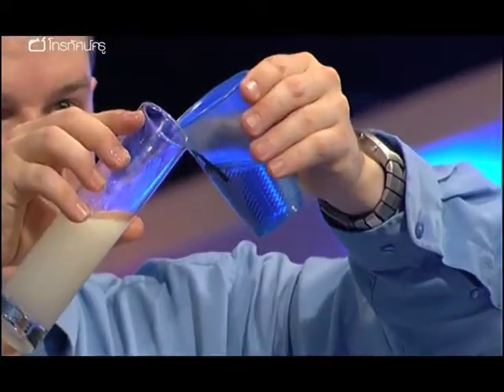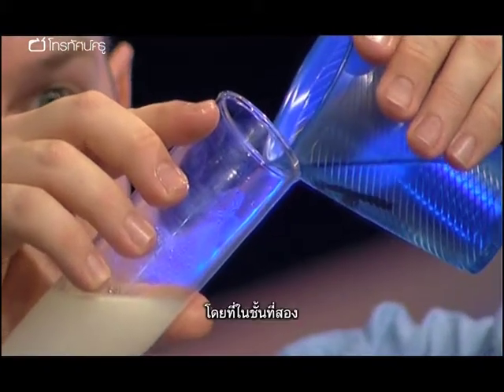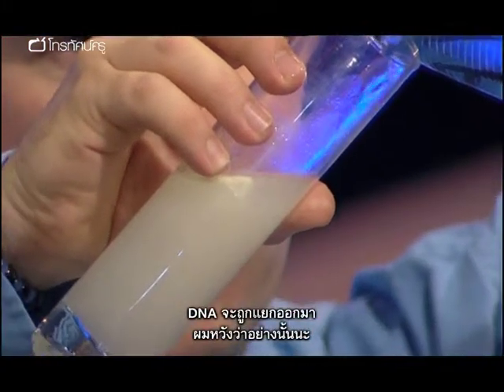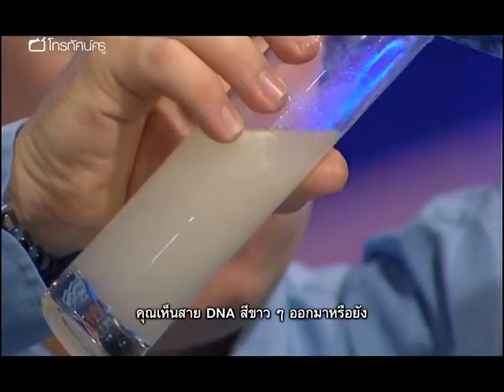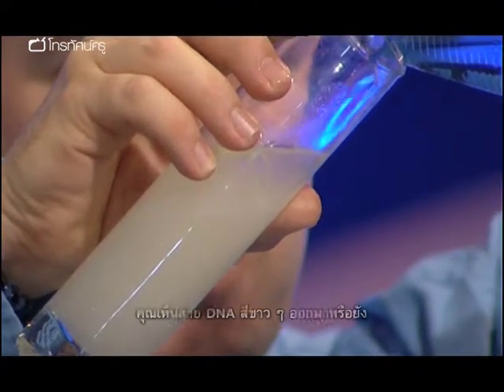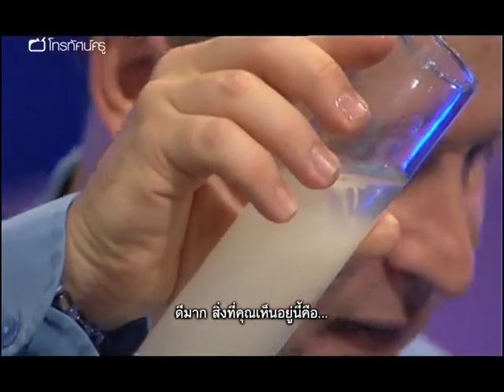Sometimes this works, sometimes it doesn't. What we'll see are two separate layers. In the second layer, hopefully, the DNA is going to separate out. And you'll see it either as some fluffy white pillows or hopefully some strands of DNA. Can you see any strands coming yet? Yeah. Look at that. That's fantastic.